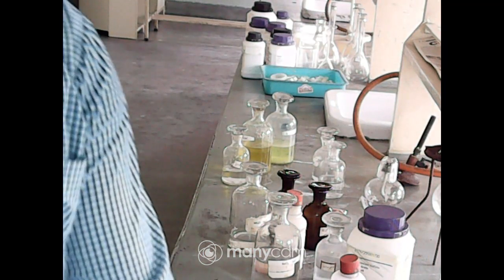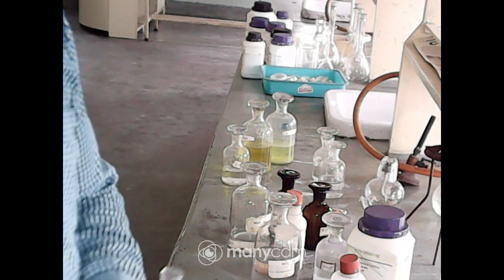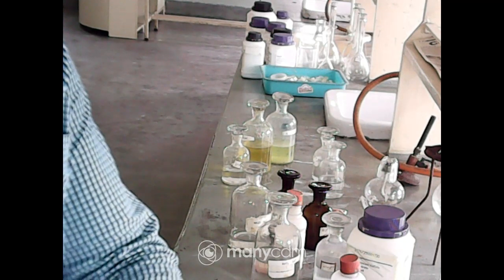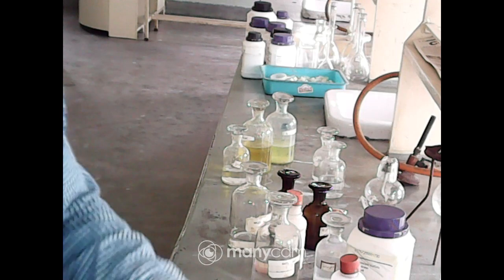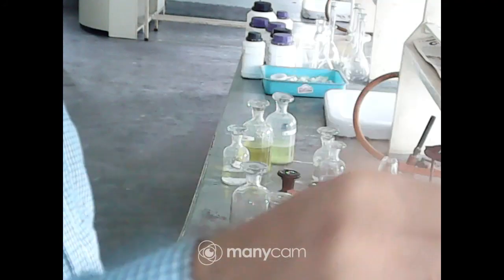Now add a NaOH bead to it. Sodium hydroxide bead, NaOH pellet. Just add one NaOH pellet to it, the solid sodium hydroxide. This is in solid form. If ammonia is present, it will evolve ammonia, and the smell of ammonia will come. As we have taken the known sample, obviously it will give the smell of ammonia. Just dissolve it well and bring your nose to the mouth of that test tube.